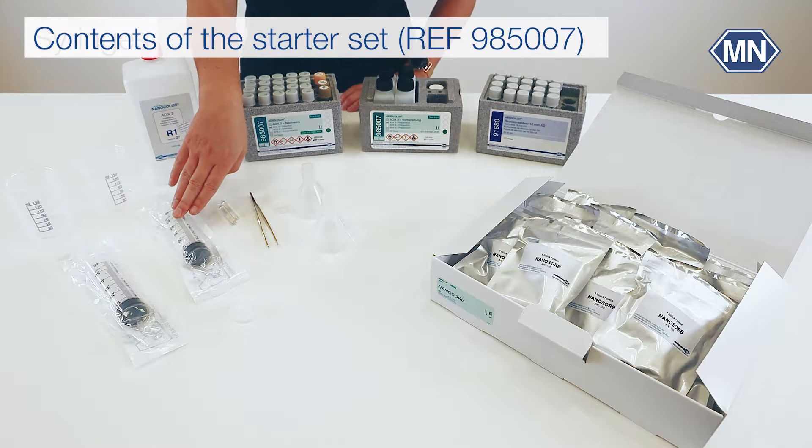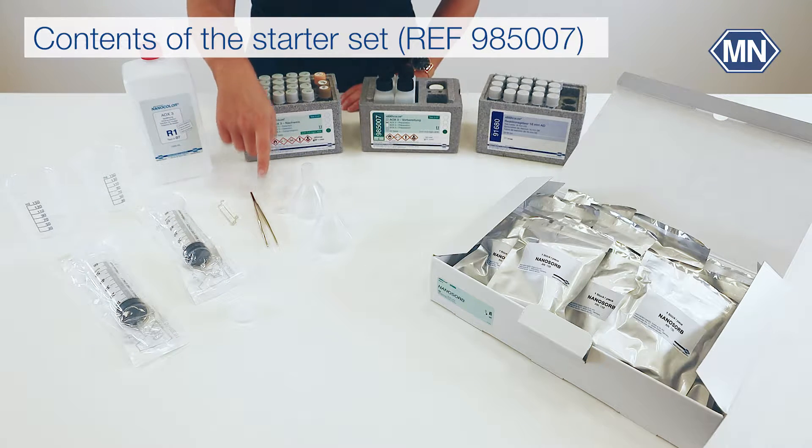The starter set comes with syringes, beakers, tweezers, an adapter, and a bottle for the rinsing solution.